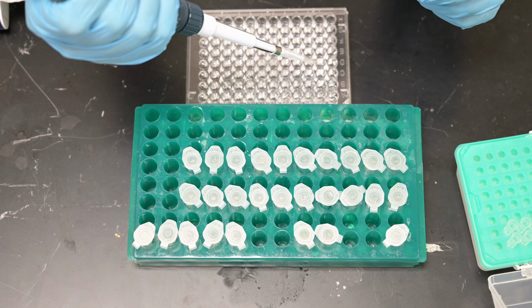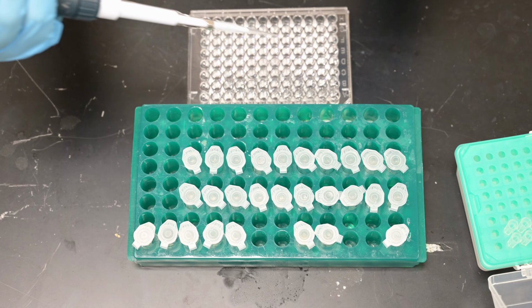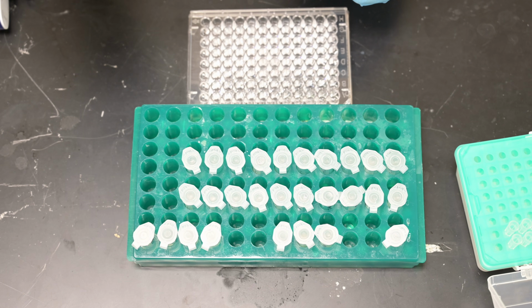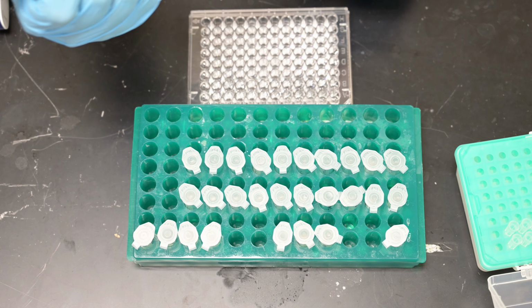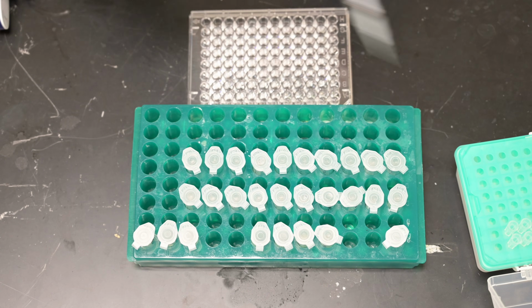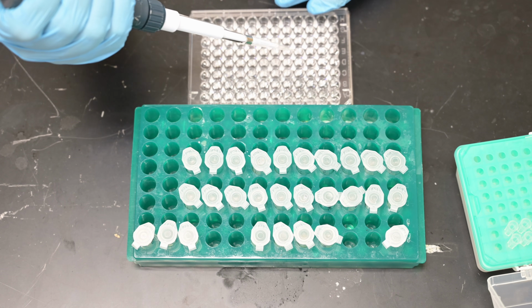Put that in D1 and E1. The third one goes into D3, E3, D4, E4.